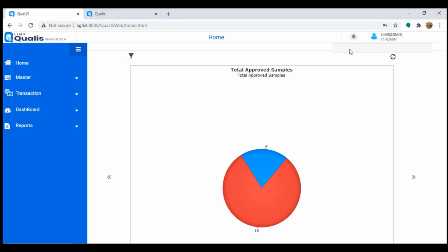It's all about traceability and a proper workflow. So when I log in, I should be able to see what is happening. I should be able to see what is pending for me to do. So that is how we help laboratories with the traceability of activities. That's the main goal of laboratory.